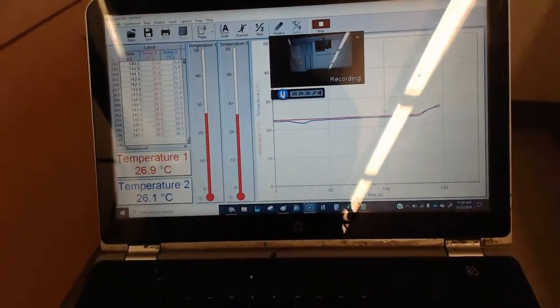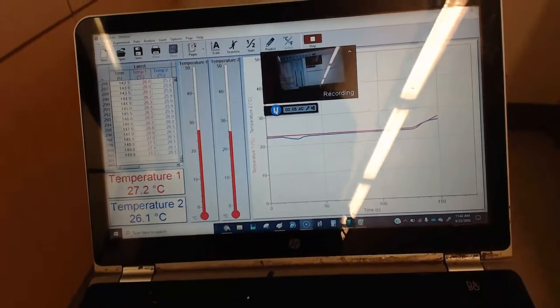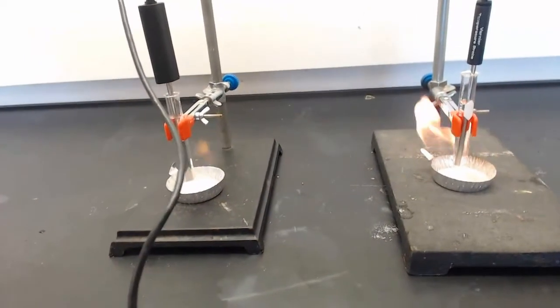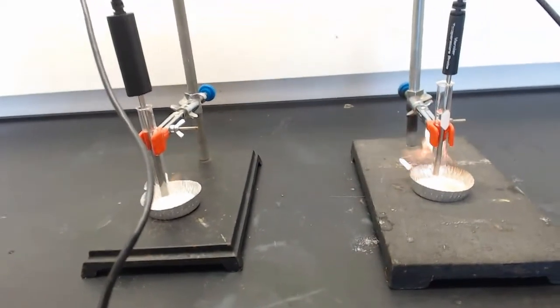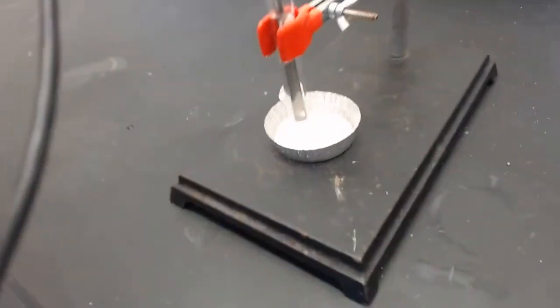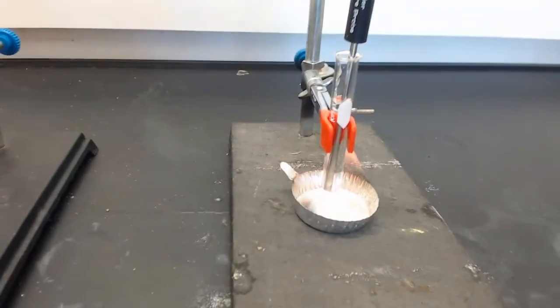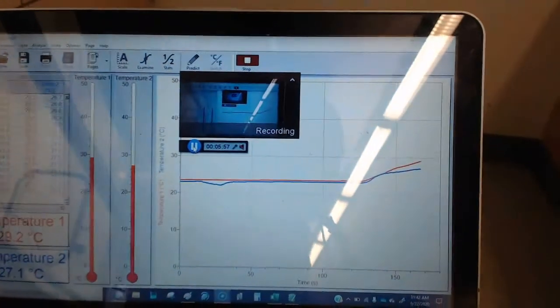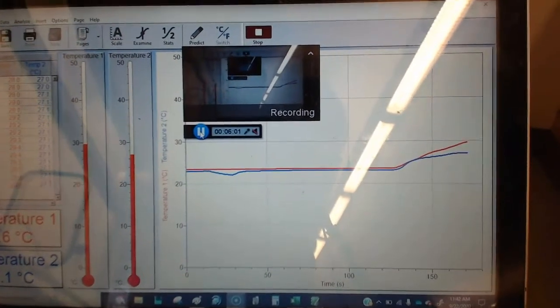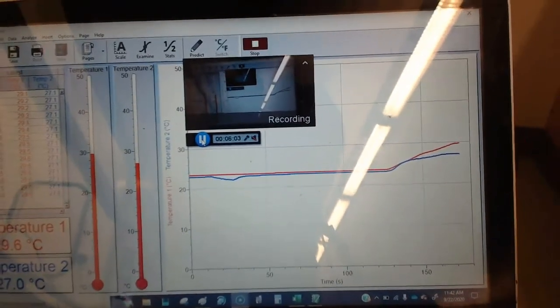We are starting to get a temperature increase. And the methanol is nearly finished. You can see that. And it's out. Ethanol is still burning like before. And the ethanol is now out. Usually it slides up for a little bit longer. Let's wait till we get a plateau.